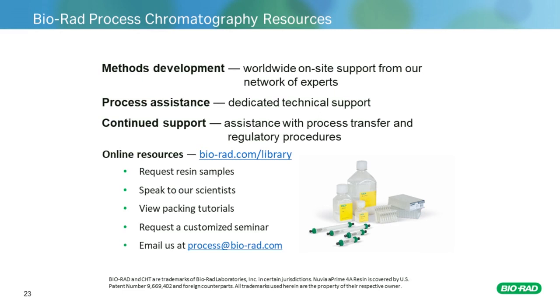In general, by salt tolerance we mean, in process purification, that you don't have to manipulate the feed stream or the sample a lot in order to achieve a good binding capacity. For example, as we know, for ion exchangers, a lot of times you are advised to do dilution or reduce conductivity in order to have a good binding capacity.